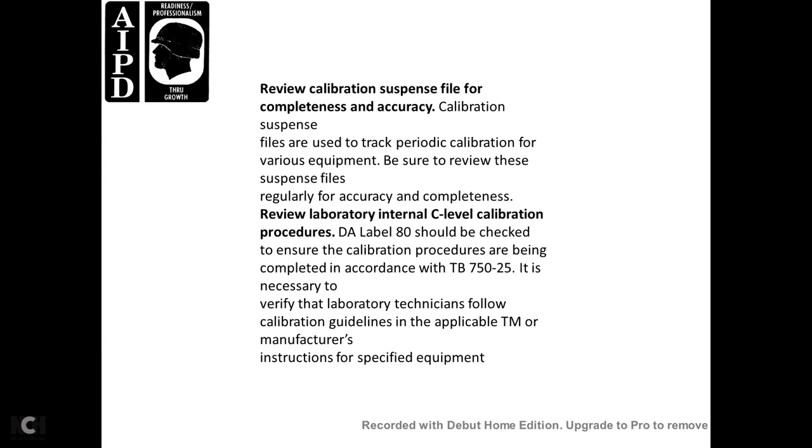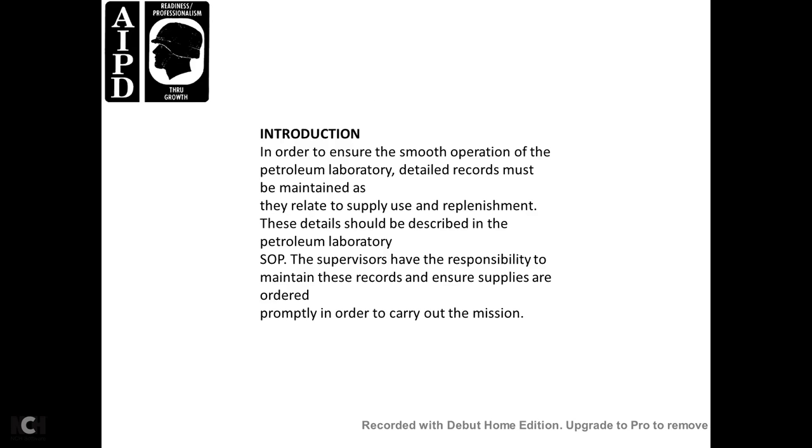Lesson 6, Petroleum Laboratory Supply, Critical Task 101-523-3400 Series. Introduction. In order to smoothly operate the petroleum laboratory, detailed records must be maintained. They relate to the supply, use, and replenishment. The details should be described in the Petroleum Laboratory Standard Operating Procedures. Supervisors have the responsibility to maintain these records and ensure the supplies are ordered and properly stocked in order to carry out the mission.